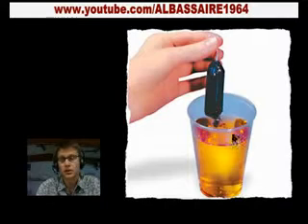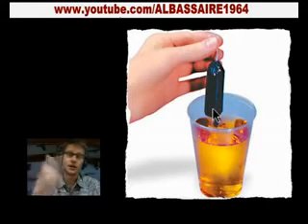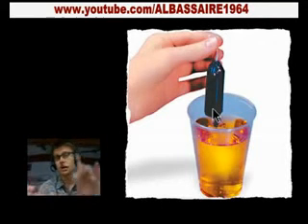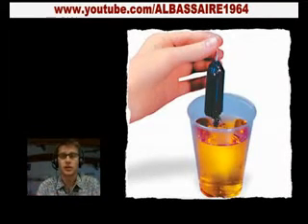What does that imply? Well, it implies that the IKI is making it into the bag. When we test it at the end, we find glucose outside the bag. So that means glucose is actually moving out, the IKI is moving in, but the starch is not able to move out. Otherwise, we would have had this blue color out here. And so the pores inside this membrane are permeable to things like water and glucose and IKI, but not things that are much larger than that. For example, it'd be starch, and so that's not able to get out.